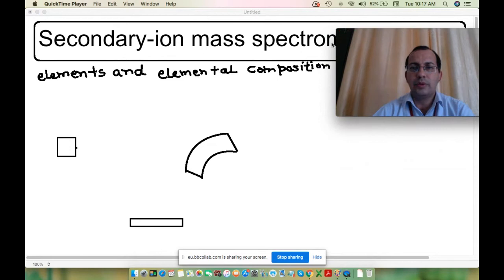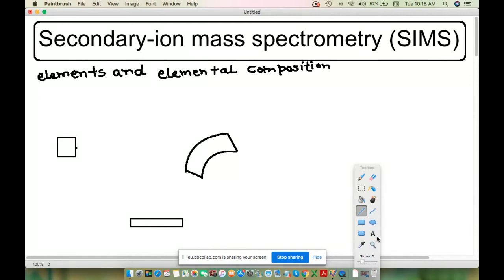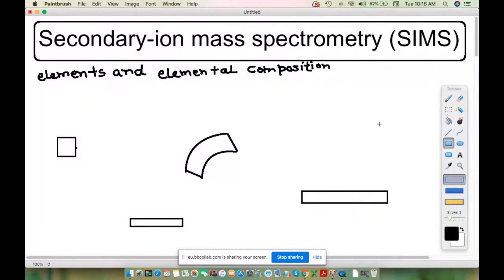After this, we would have the detector, somewhere here. With the help of these things, we have to see how this setup works, with the help of the information which we have.